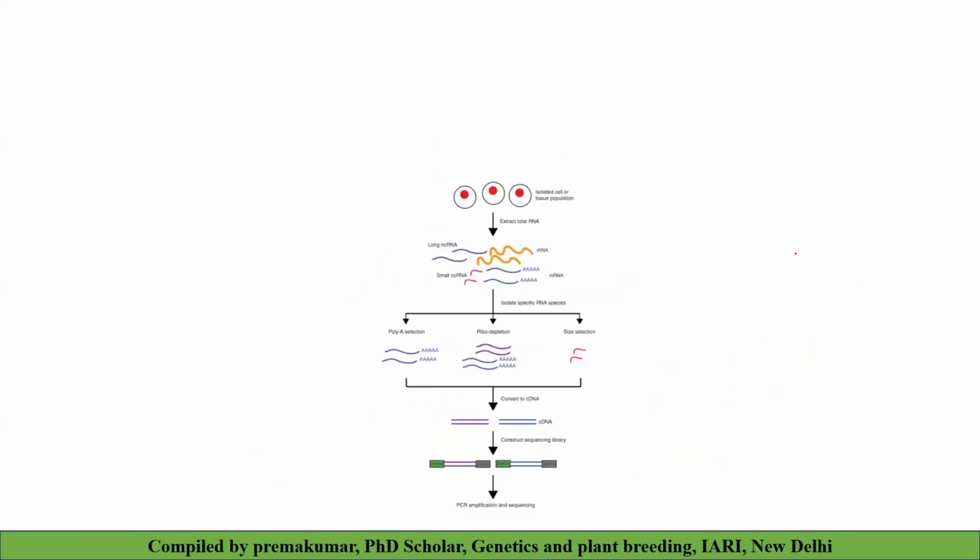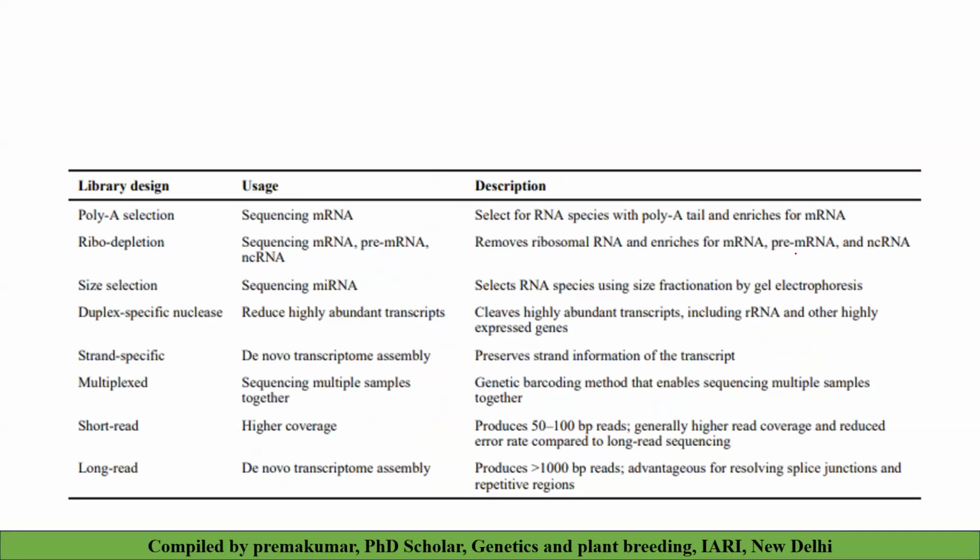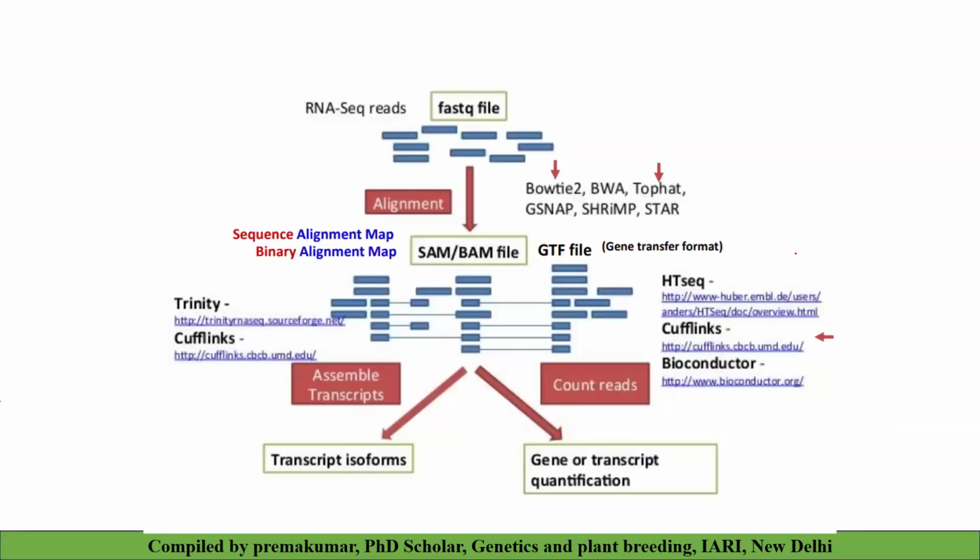Yes, sir. Any doubts? Understood. The DEG file is the final file, sir? Yes, DEG is the final file. Sir, in mapping, after mapping, what file will we get, sir?